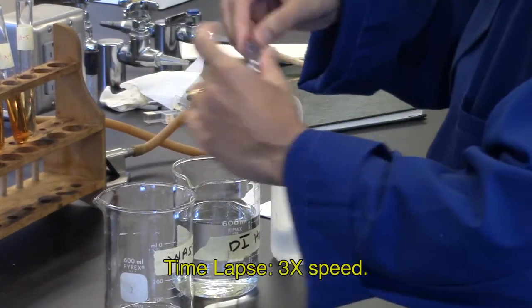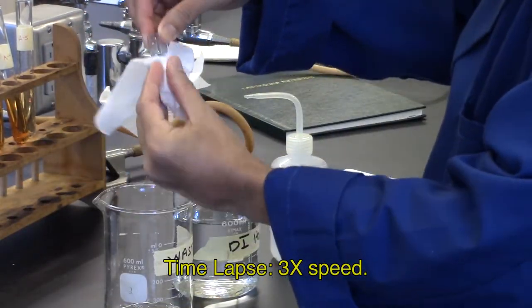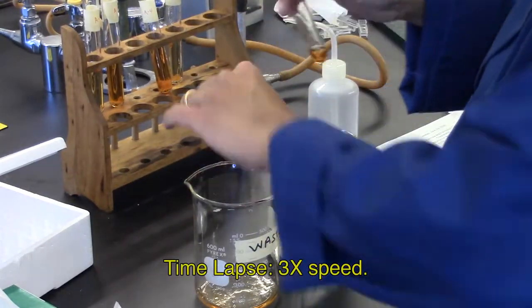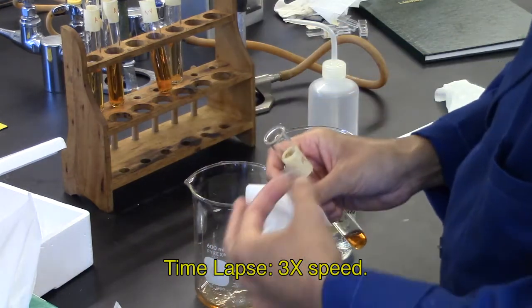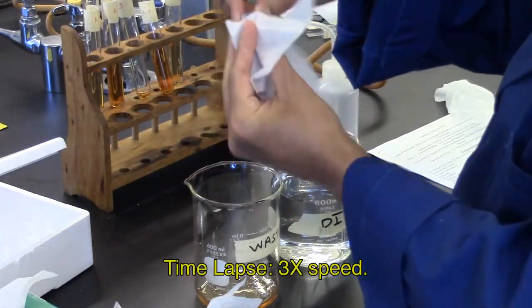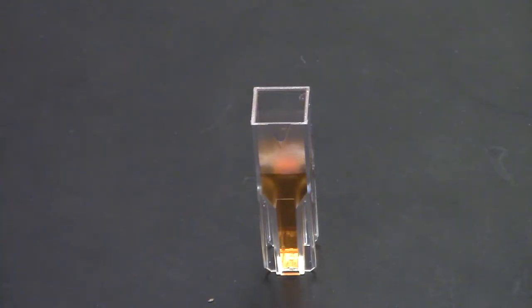Fill one cuvette with distilled water for the calibration. Rinse a cuvette three times with the sample A3. Use the waste beaker. When you are actually measuring, the cuvette needs to be filled to a little over halfway.